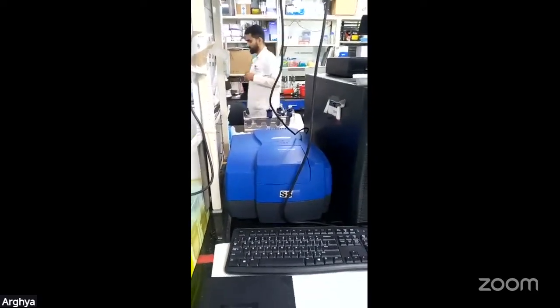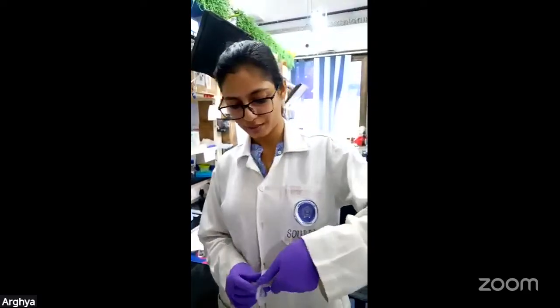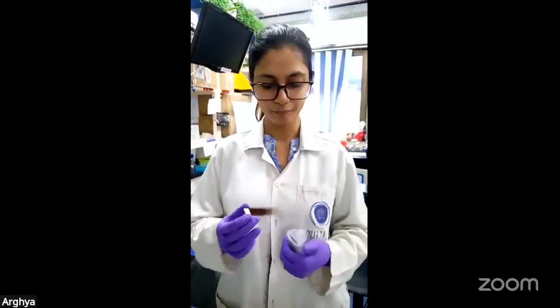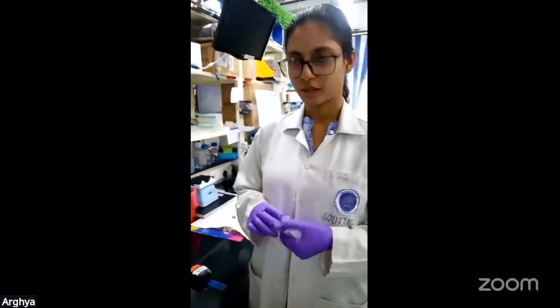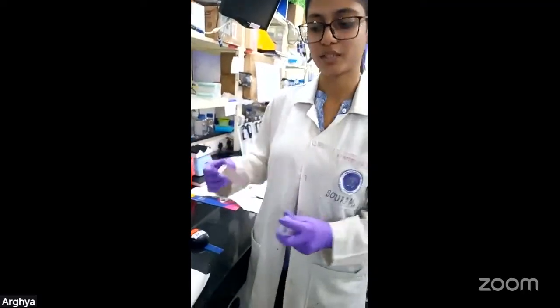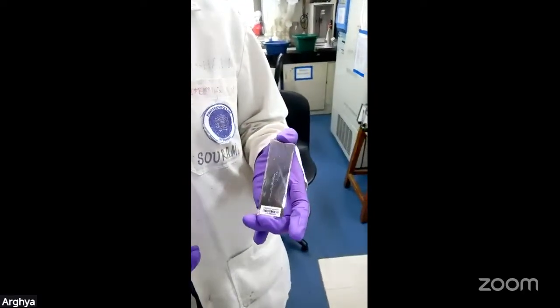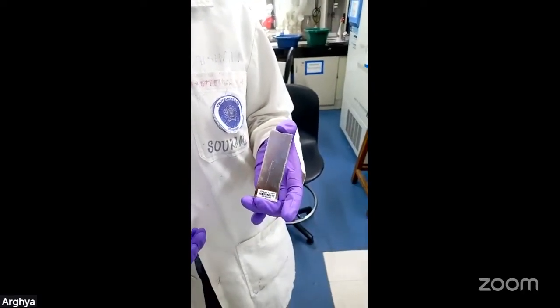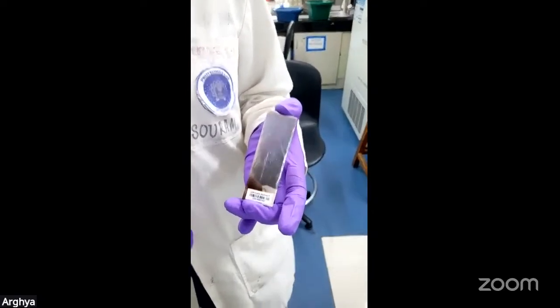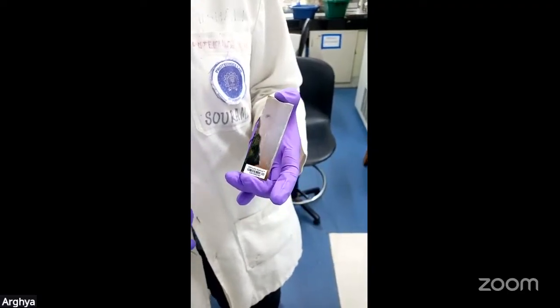So basically, a microarray is a high throughput platform where we can analyze thousands of biological interactions on a single solid surface, typically a glass slide, which looks like this. There are many types of microarrays that we can study based on what biological interaction we want to study. You can see a high density microarray slide in which around 18,000 proteins have been spotted in replicate. These are the HuProt chips which have been manufactured by CDI at Johns Hopkins.